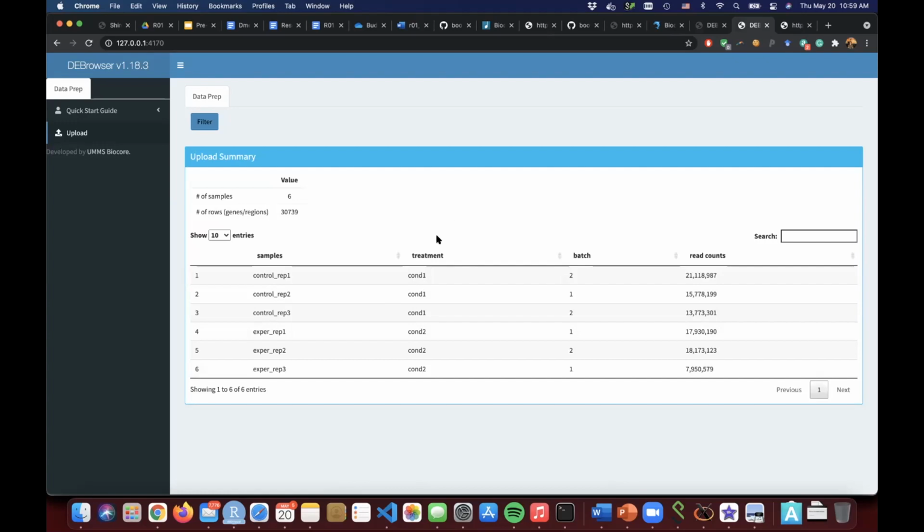So this might make your condition selection much faster when you do your DE, if you can define multiple columns, and in each column you can keep empty the other samples, but put the condition numbers or strings to define those samples. Then your selection will be much easier. But let's do this, and see how we are using DEBrowser and how it makes your life much easier.